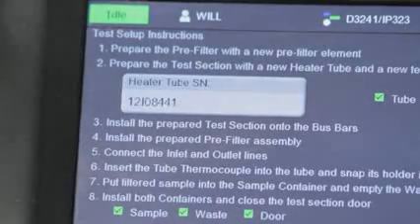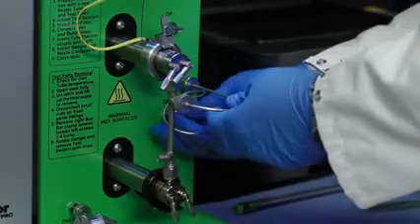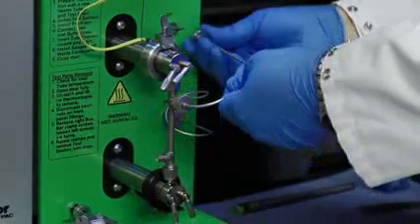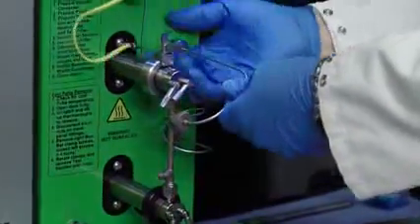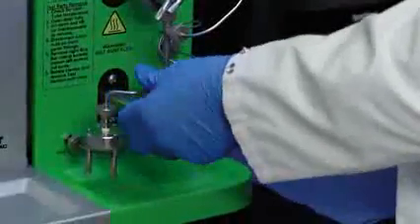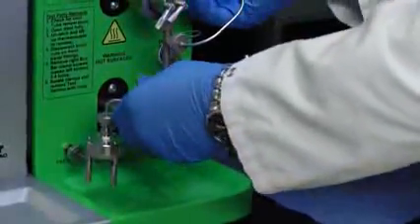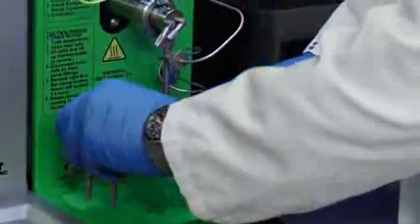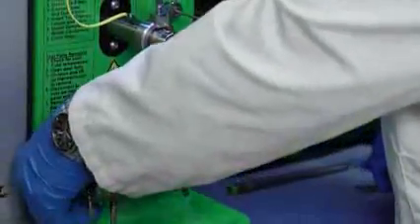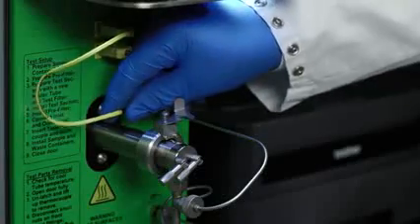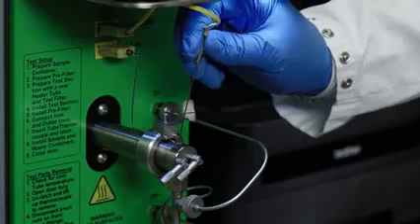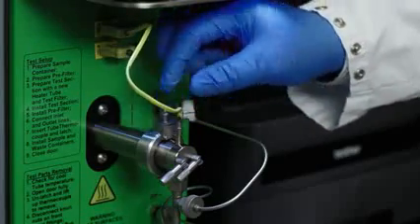After you confirm that it's correct, install it in the bus bars. If you use an intelligent heater tube, the serial number will automatically populate the heater tube serial number box. Now install the pre-filter assembly, then install the inlet line between the pre-filter assembly and the test section, and connect the test section outlet lines.